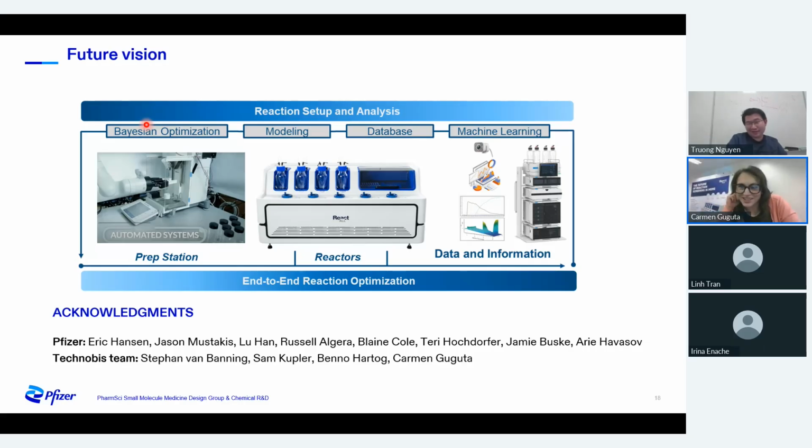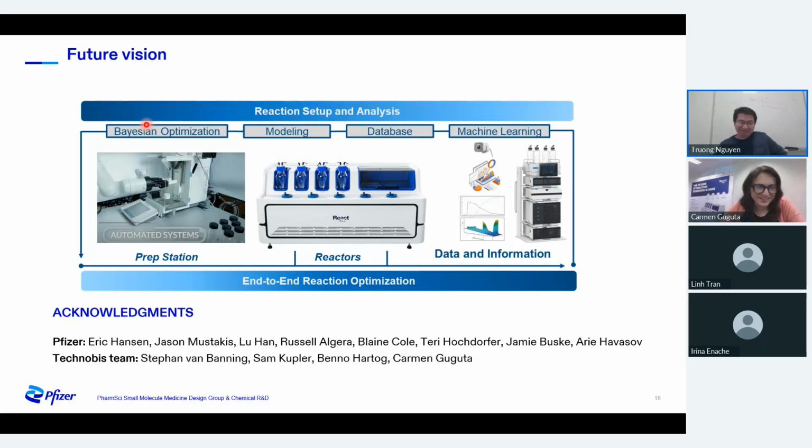Well, you still need the HPLC, right? Yes, it's just an automated sampling platform to get the data. We still need to do LC to analyze that.